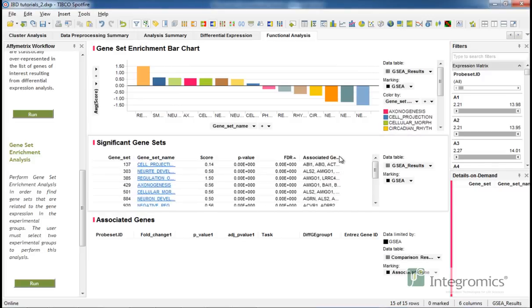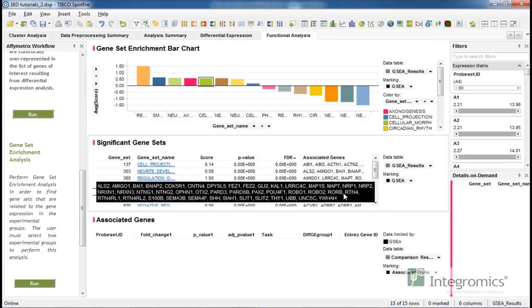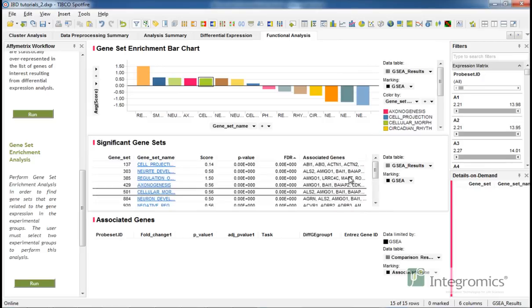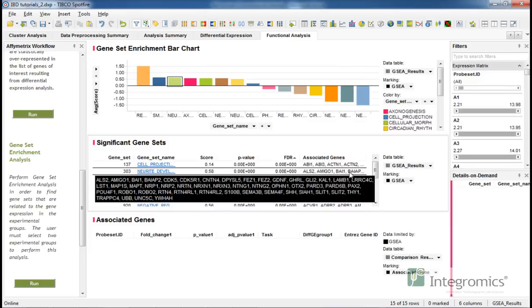This table shows for each geneset the name and association score. The p-value and FDR value inform us about the statistical enrichment of each geneset with respect to a background distribution as determined using a permutation test.